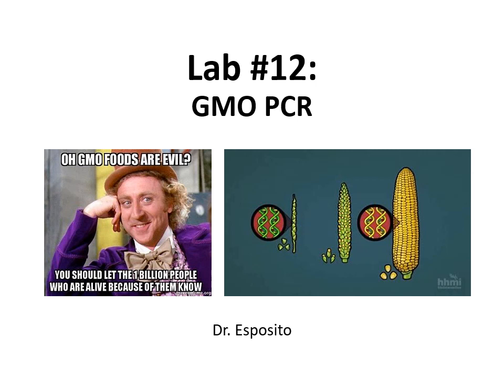Hi everyone, and welcome to lab number 12, which today focuses on the GMO PCR experiment that you would have done in lab. Now you're all already experts at PCR thanks to the previous lesson, but now we're going to use it to see another application of this technology. Keep in mind, you are getting close. You're almost done with this semester.